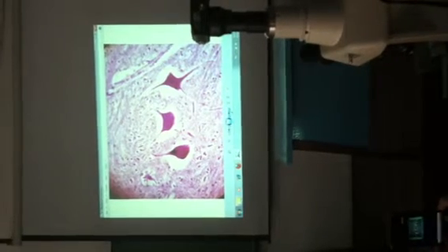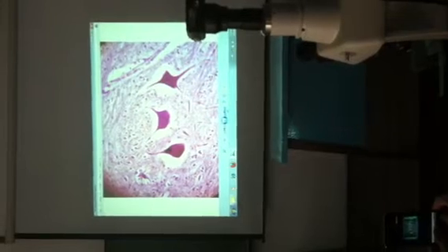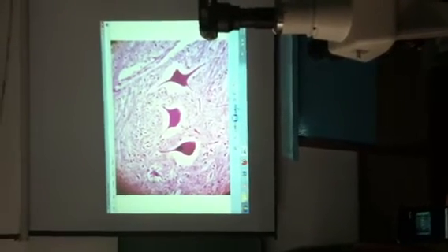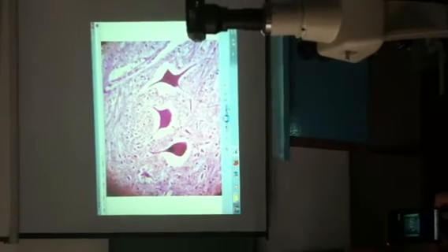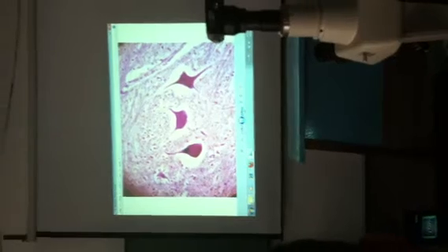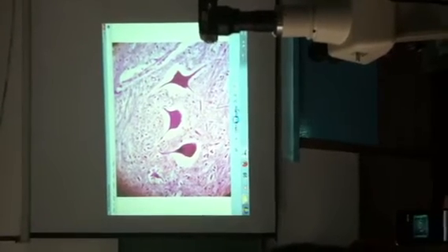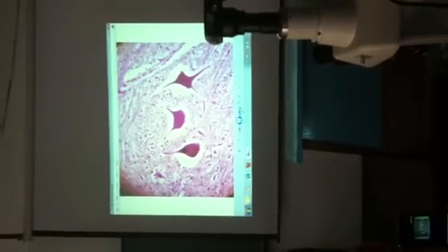So this is your neuron. You'll get a more detailed picture of what neurons are like when we go to the nervous system. So we're just asking you to draw, illustrate the large cells where you can make observations, the structure of the cell.